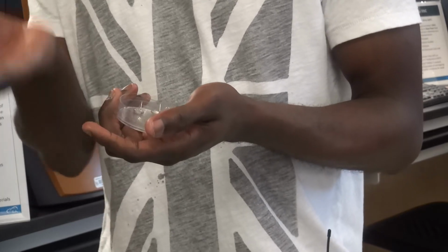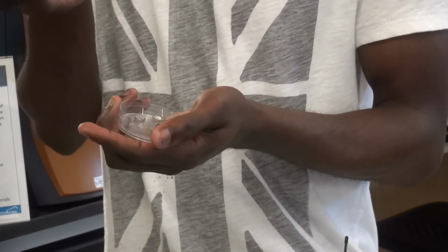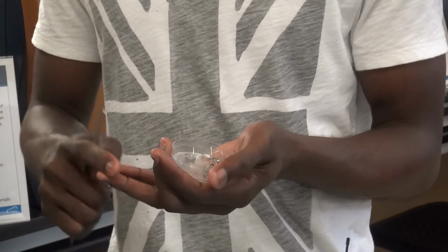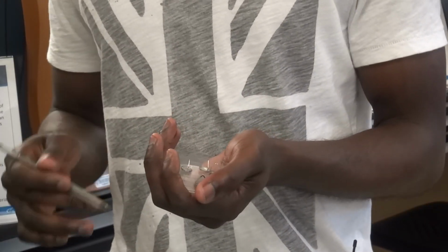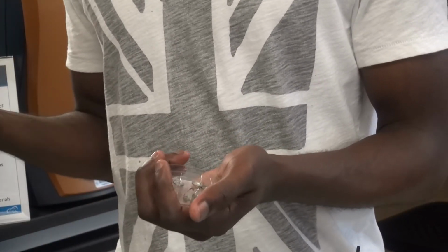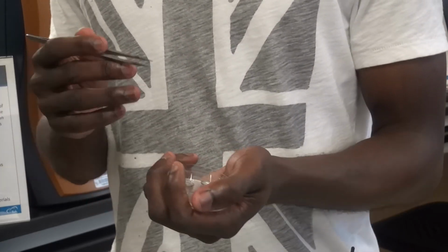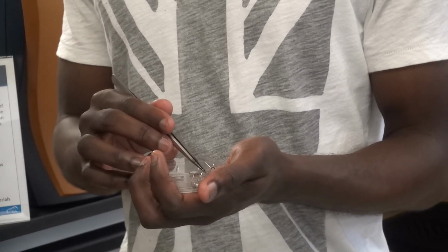So when the autosampler tries to remove the pan from the hook, it actually gets stuck, right? Trying to lift it off, you can bend the hook, you can tilt over the sample and spill things. You can drop the sample pan right down into the furnace. So all these things require maintenance and fixing. That is actually pretty problematic, especially if you start bending things and spilling things. So this was their sort of solution to that.